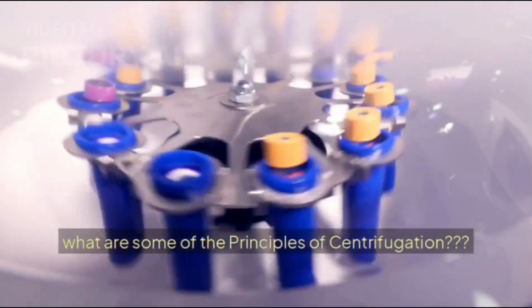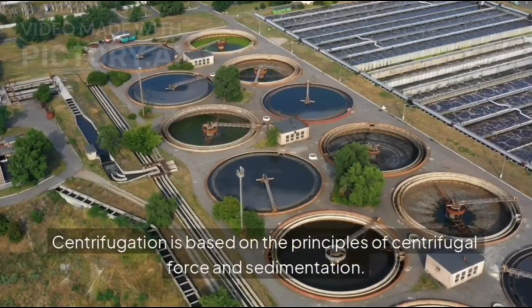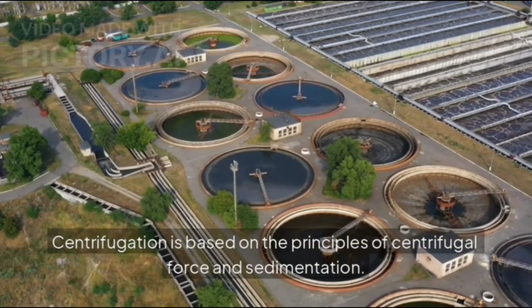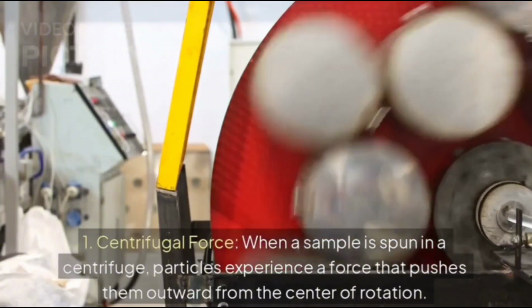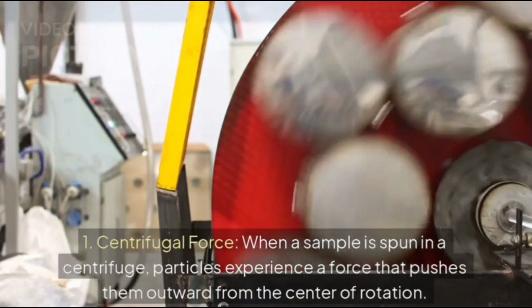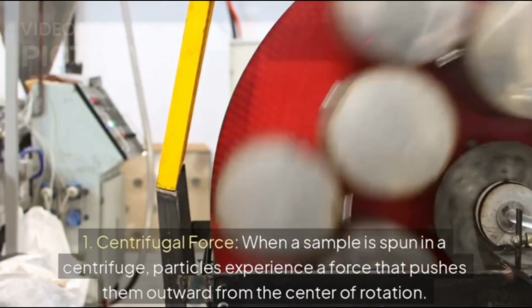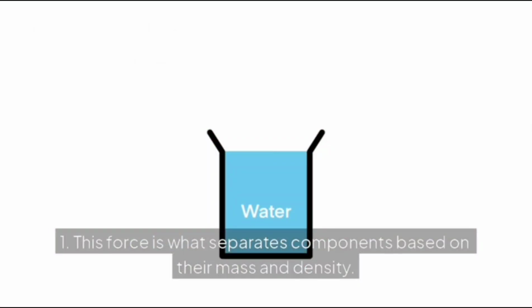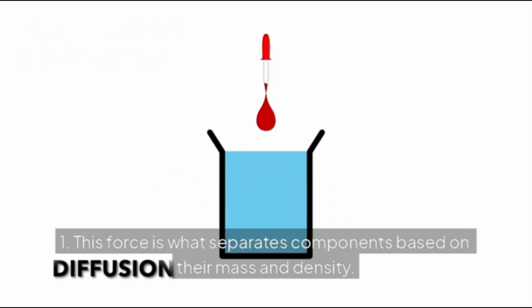What are some of the principles of centrifugation? Centrifugation is based on the principle of centrifugal force and sedimentation. Centrifugal force: when a sample is spun in a centrifuge, particles experience a force that pushes them outward from the center of rotation. This force is what separates components based on their mass and density.